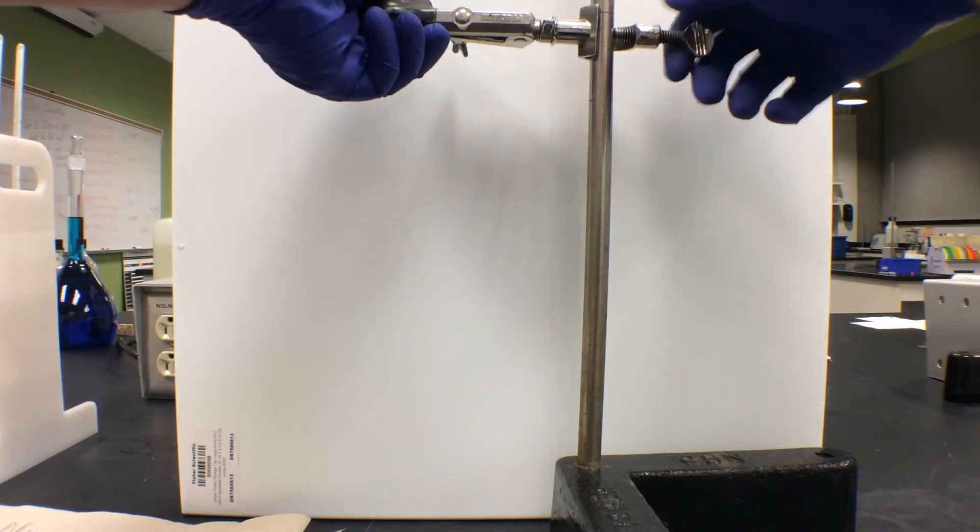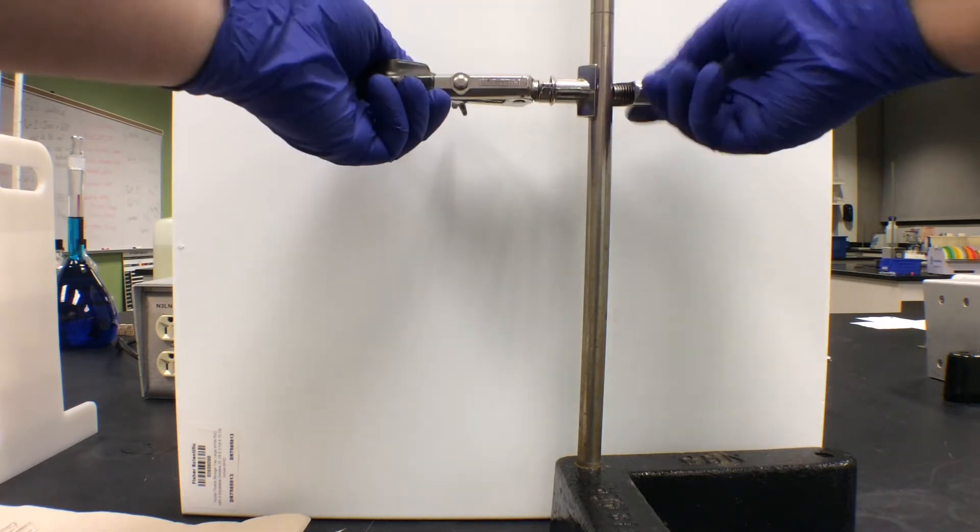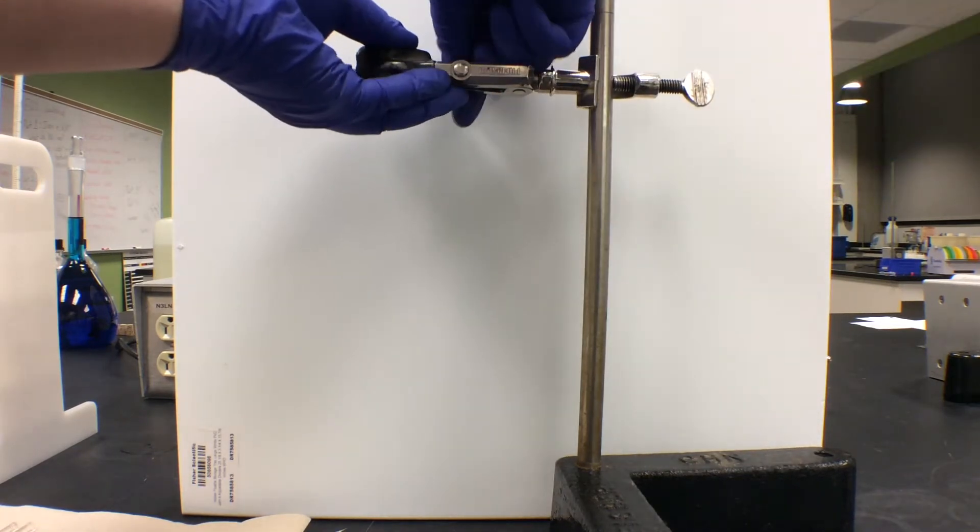First, we must set up a thermometer using a utility clamp, a rubber stopper, and a ring stand.